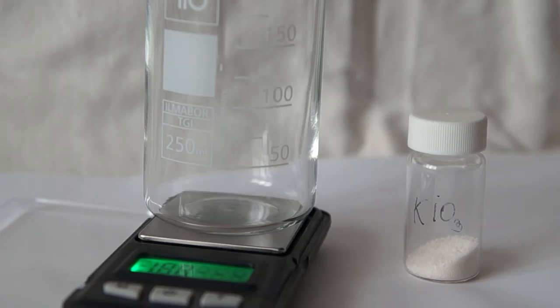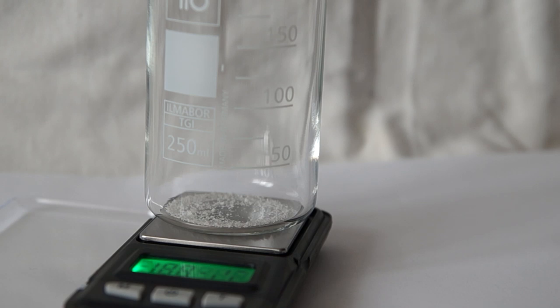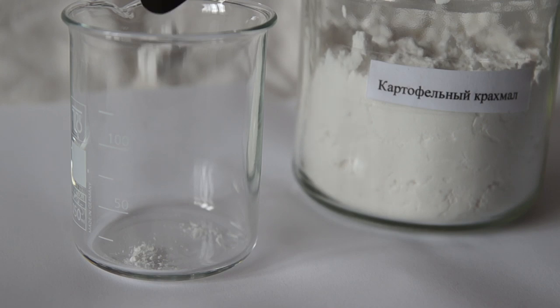Now let's prepare the second solution. Take 0.5 g of potassium iodate and dissolve it in 35 ml of distilled water.